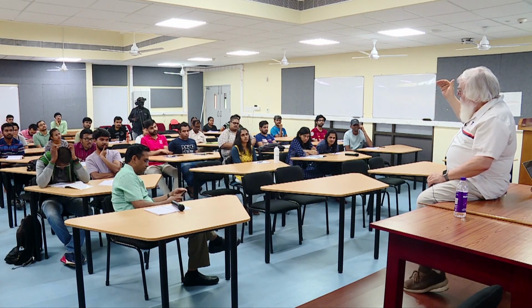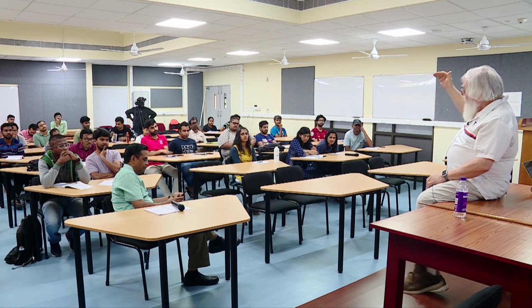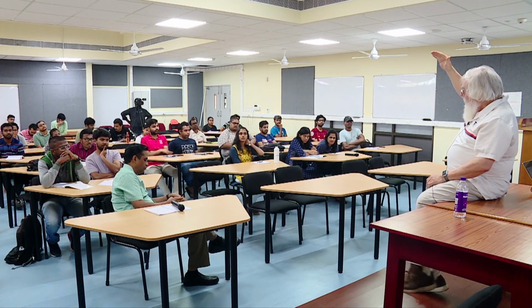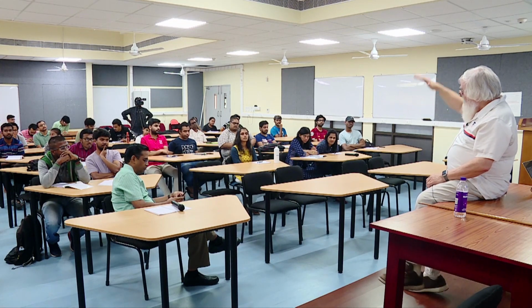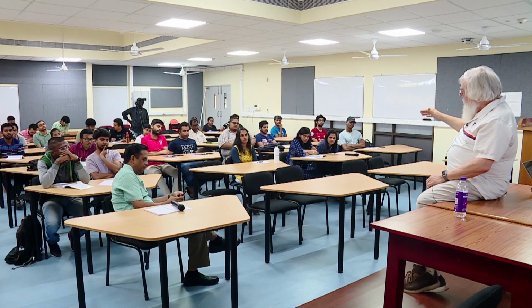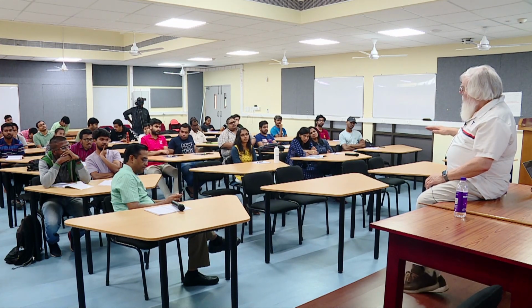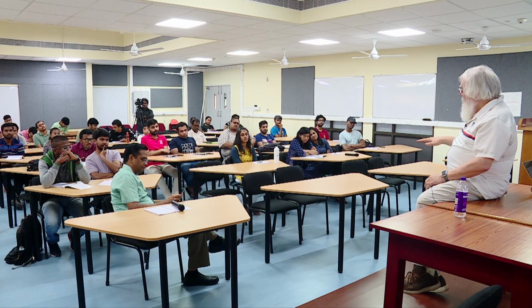We're going to start talking first about electron diffraction in the microscope. I'll give you some basic feed-throughs on what electron diffraction is and how we get information from electron diffraction. And then Hamish is going to come in and talk about some advanced diffraction technologies for doing microstructural analysis and defect analysis. That will cover all of the afternoon. So we'll talk mainly diffraction this afternoon.